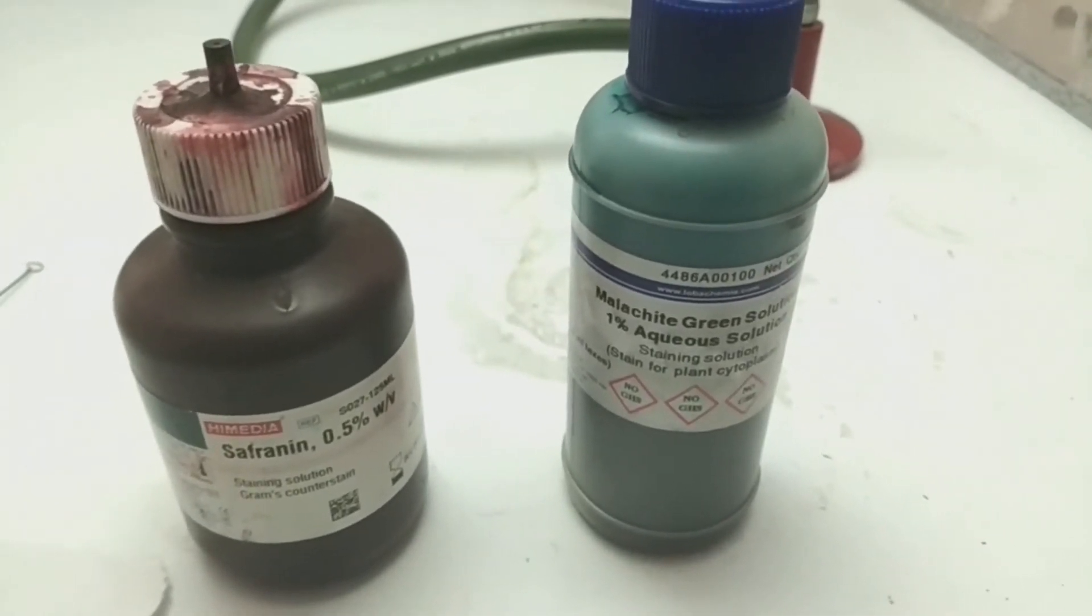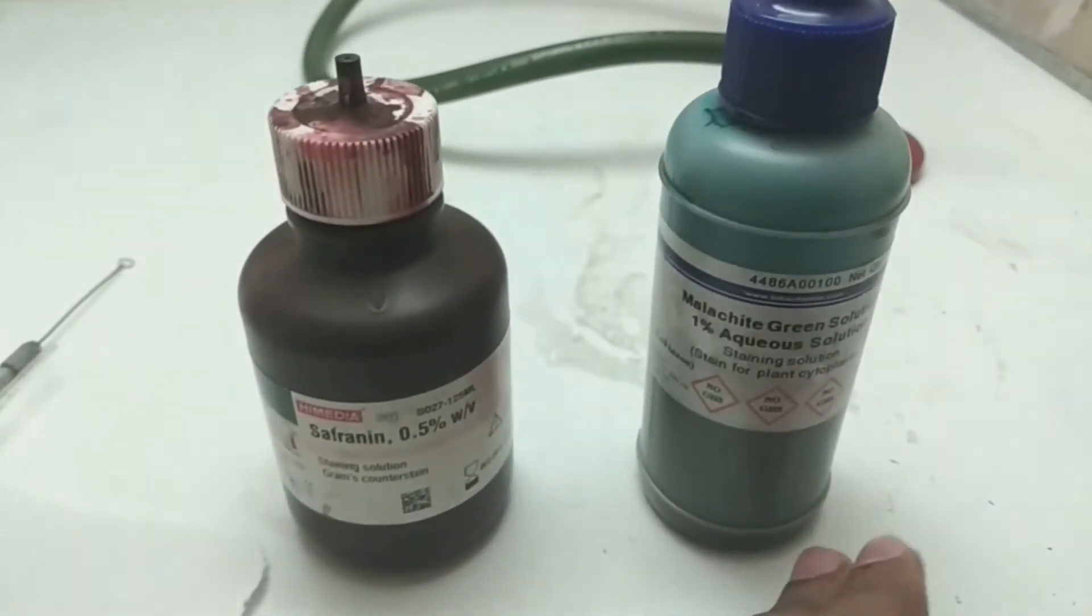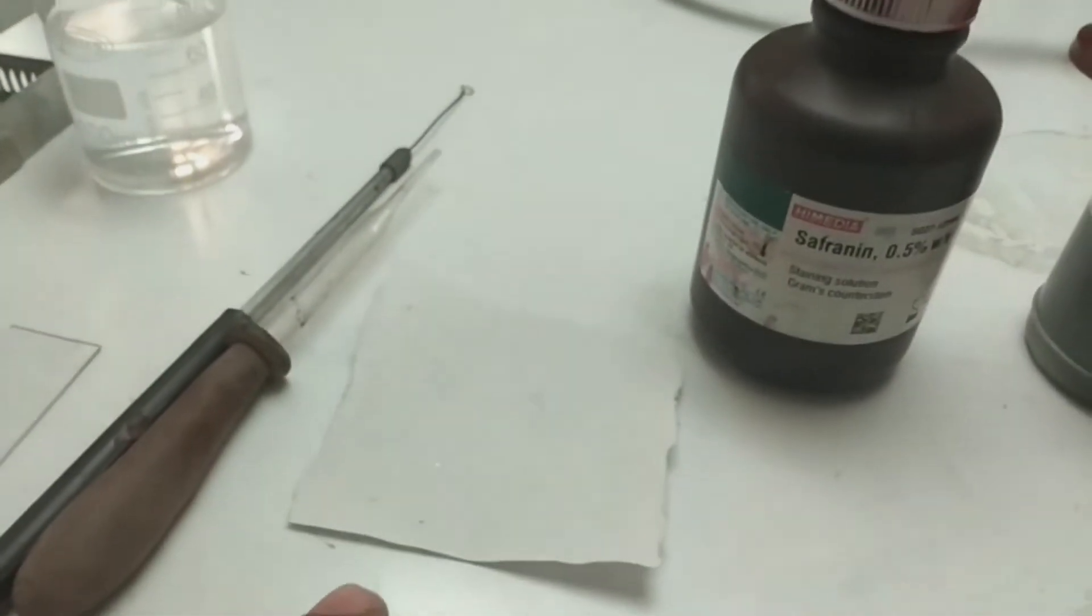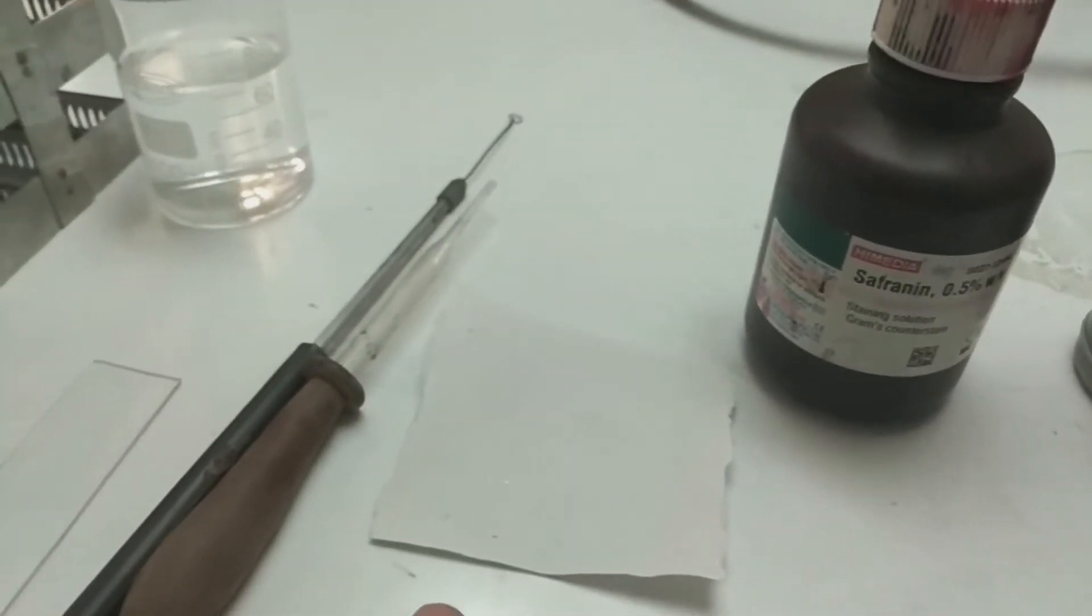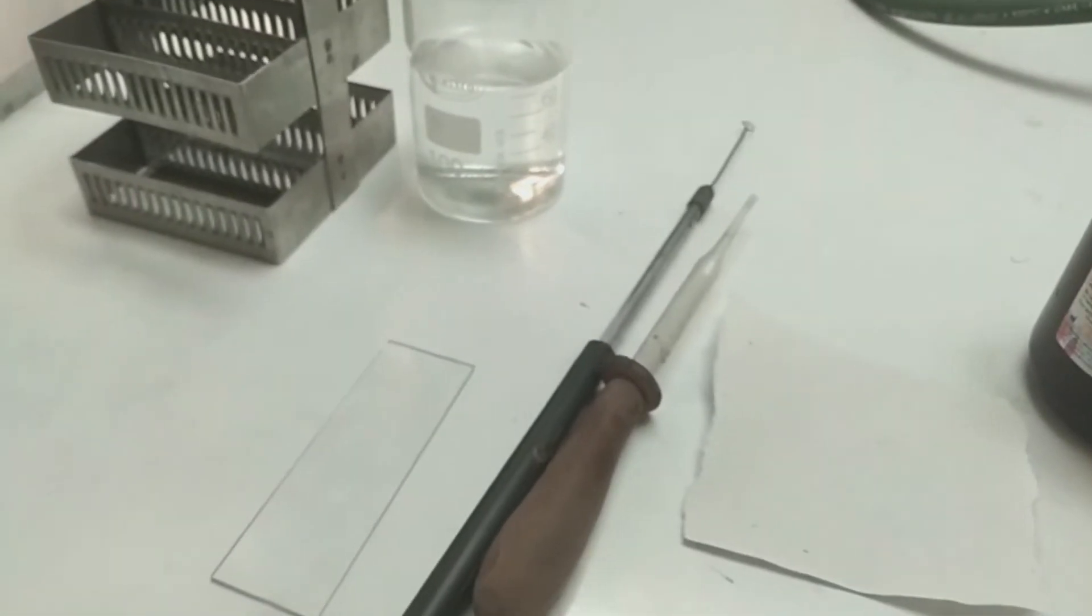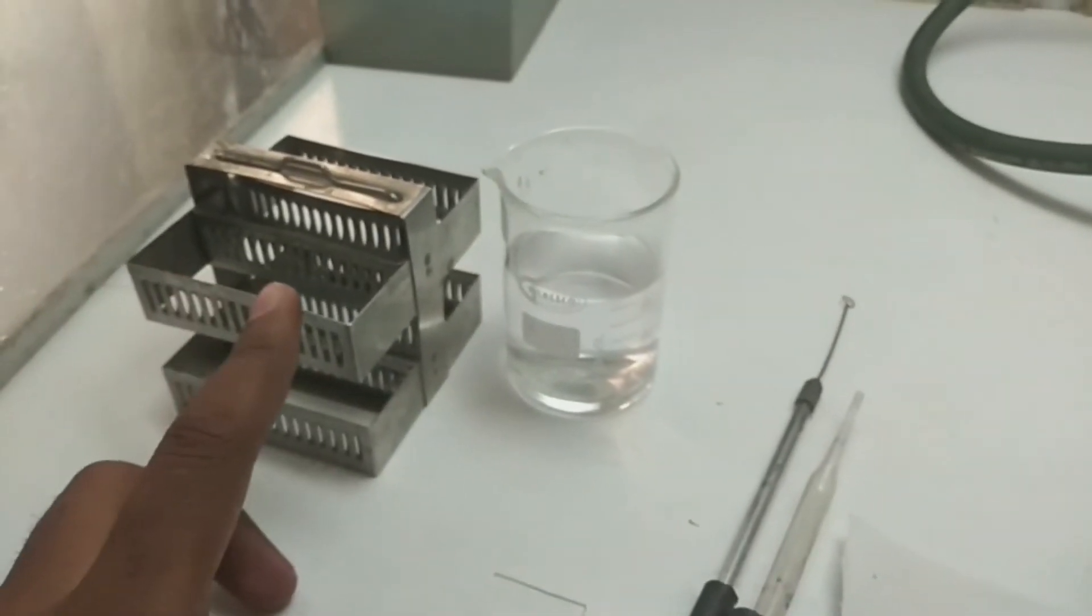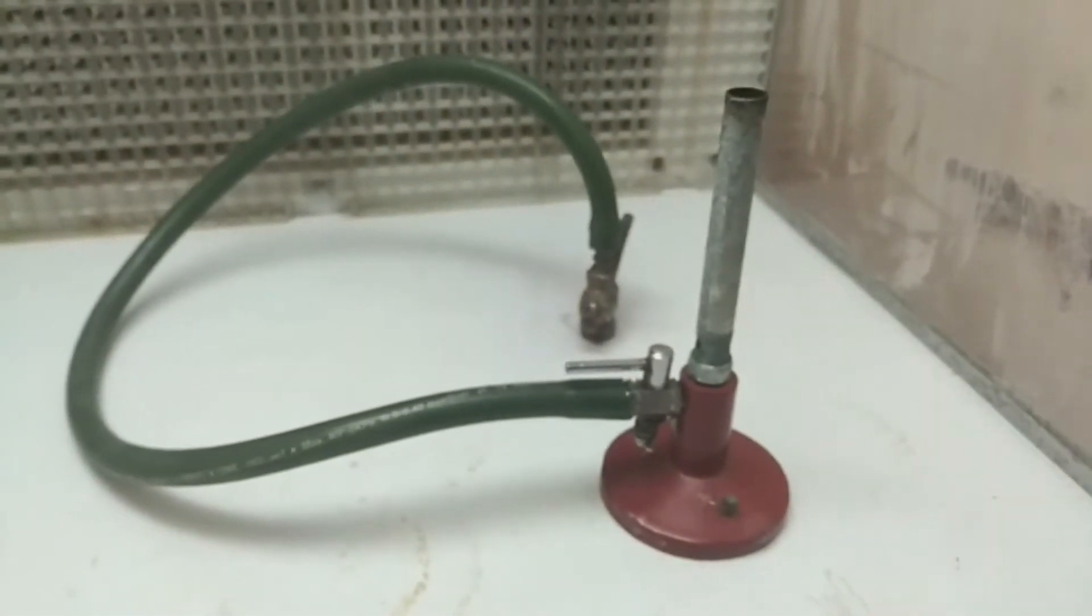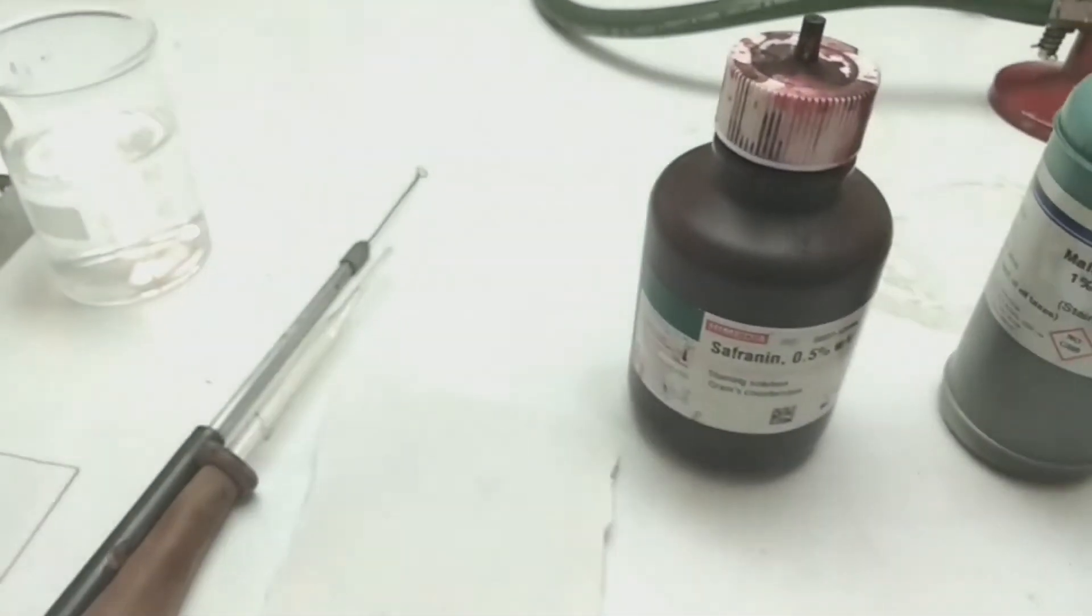The requirements for endospore staining: two important stains, safranin and malachite green for counter staining and pre-staining. Second, we require a filter paper for covering the smear. Third, a dropper. Fourth, an inoculum loop. Fifth, a clean grease-free glass slide, distilled water beaker, and a slide rack. A Bunsen burner for heat fixing the smear, and the culture of bacteria which we want to visualize the endospore.